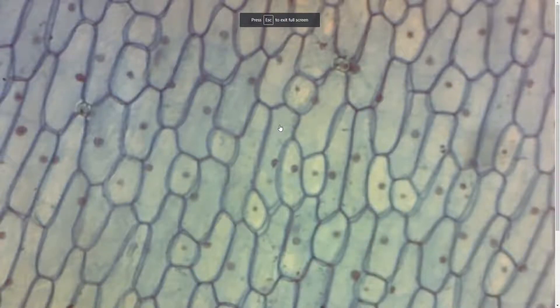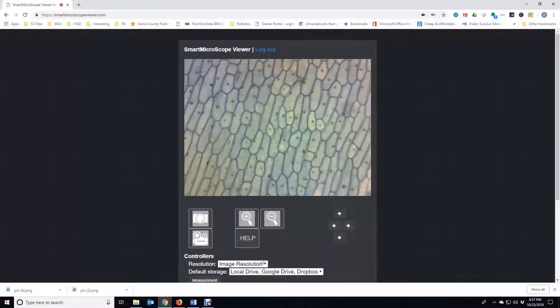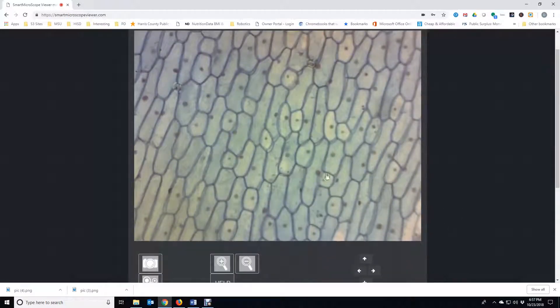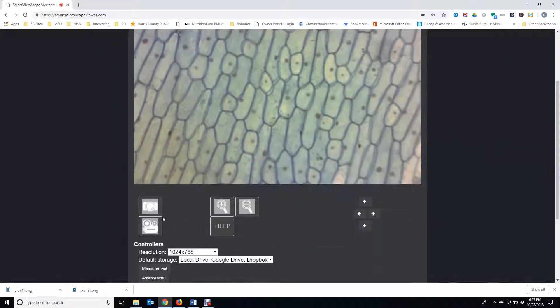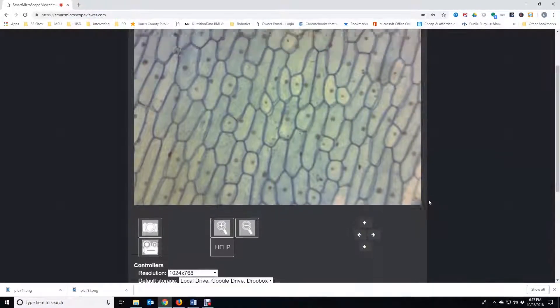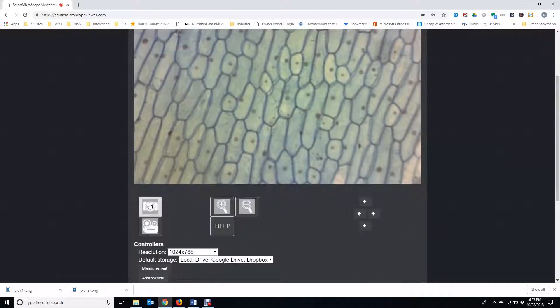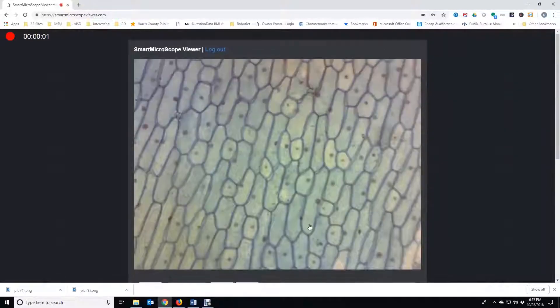Click the image to go to full screen mode — this is ideal when projecting for all students to see. We can increase the image resolution. You can take pictures and record videos. Notice the timer begins when the video starts and turns off when the recording stops.